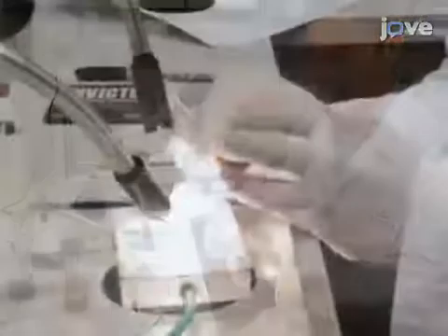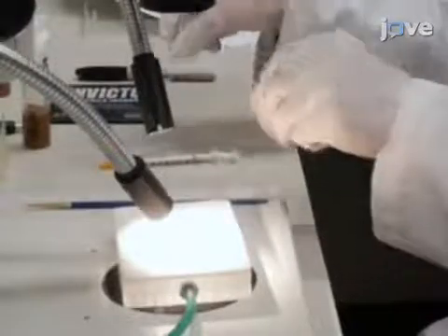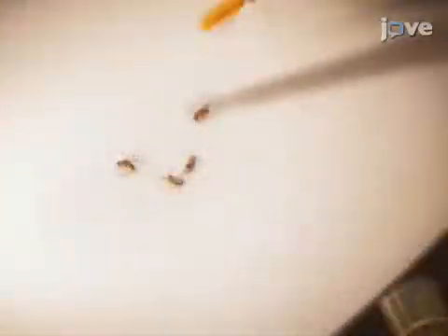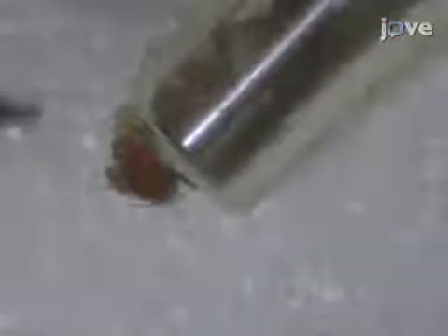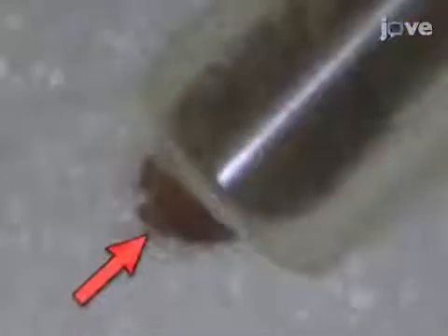Anesthetize a single 2-day-old adult female fly using carbon dioxide. From the carbon dioxide pad, use a fine brush to gently transfer the fly into the holder. Then gently tap the holder until the head protrudes from the tip. If the proboscis is exposed, use a blunted 1 milliliter syringe needle to gently tuck it back inside the tip. It is critical to keep the fly body, especially the mouth part, inside the holder.